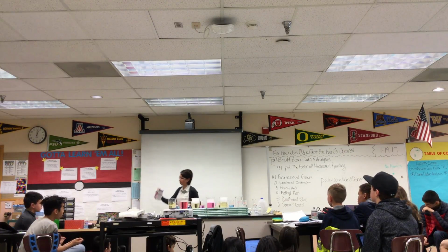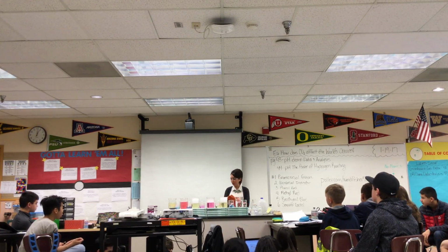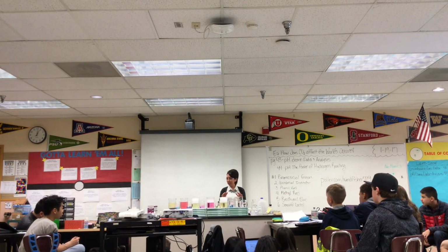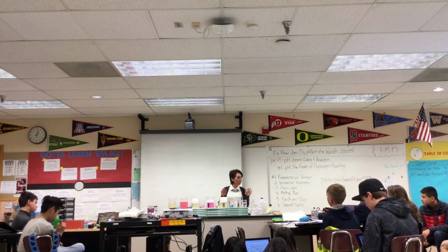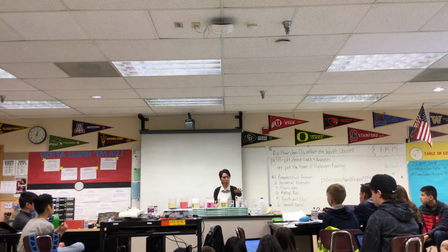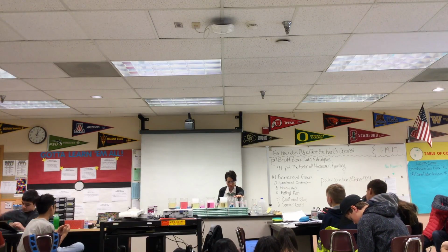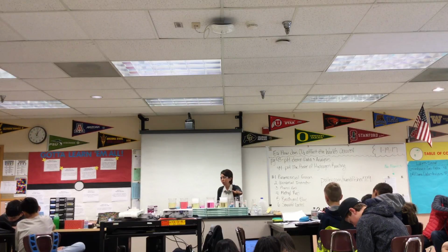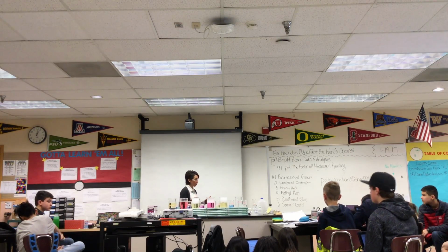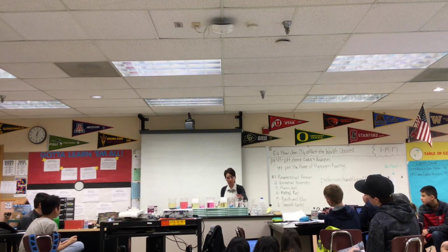Instant Ocean is going to give us a pH very similar to ocean water because it's used in saltwater aquariums. The ocean is a very, very delicate system, and the pH normally is right around 8.0 to 8.2. So for our starting pH of seawater, we're going to write down 8.2. The whole point of this is to look at how man-made greenhouse gases, specifically carbon dioxide, are affecting our oceans.